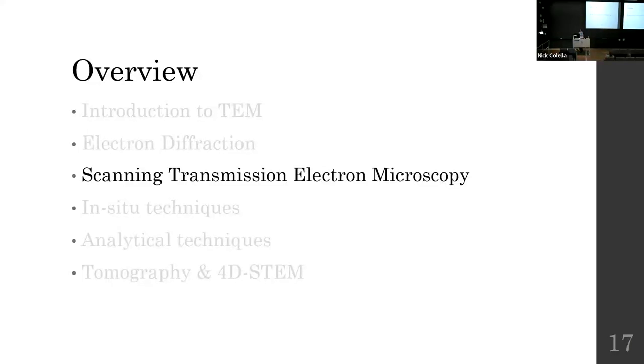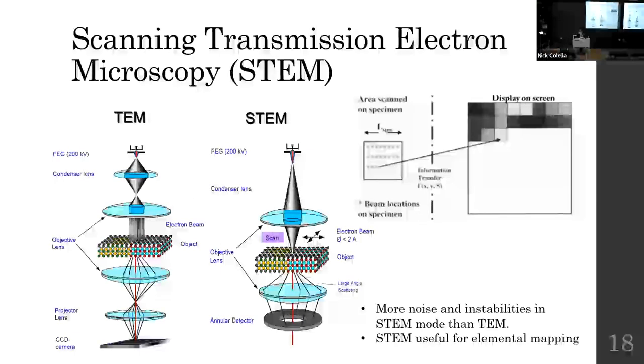All right, on to STEM, my technique. We already talked about what TEM is. As a recap, we've got a parallel beam of electrons hitting the sample. We form an image under the bottom.